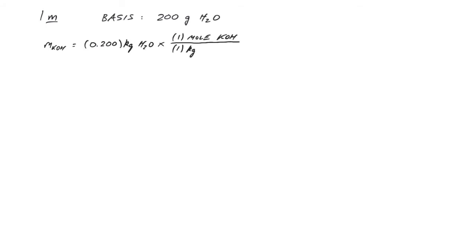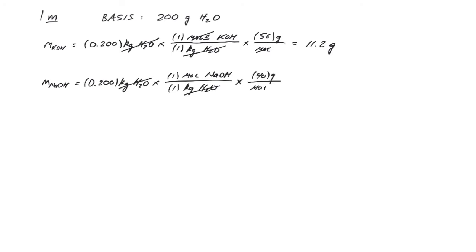It's up to you, but I would probably recommend staying below 1 mol, which is 1 mole of alkaline hydroxide per kilogram of water. So one thing I've done in advance is calculate the mass of KOH or NaOH that I'll need for a given amount of water. After I'm done weighing out the dry hydroxide, the rest goes back into storage, where it remains dry.